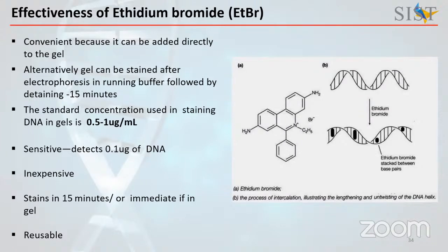And this stains within 15 minutes. So it takes a small amount of time to stain the DNA. And you can also reuse this EtBr stain. All right. So that's why it is most effective in gel electrophoresis.